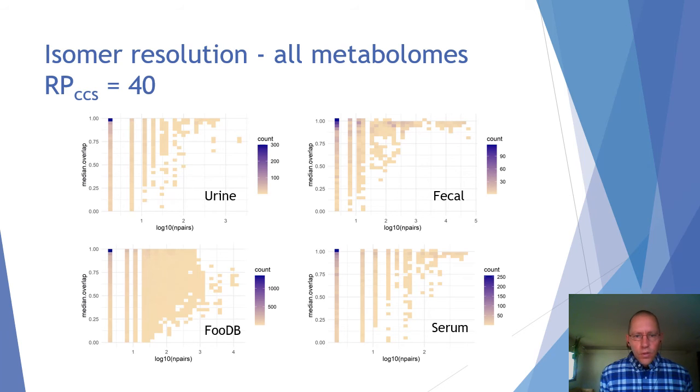So now I mentioned in my title, thinking about the future of ion mobility. And the fact is that current instrumentation gets around 40, but some of our commercially available and developmental instruments can get much higher resolution. So what do these plots look like if we assume a resolution of 600 instead of 40, something more akin to chromatography?